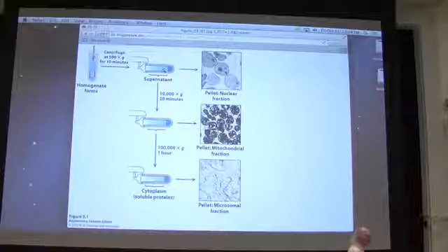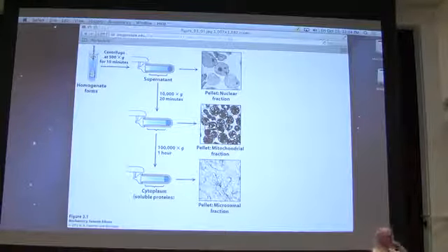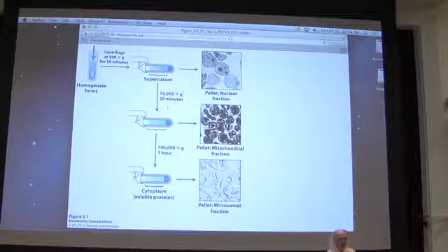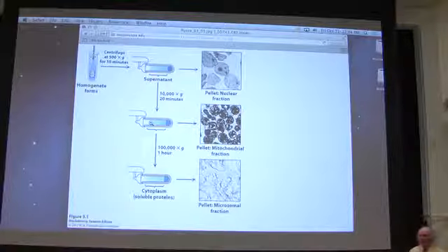If we spin that at a low rate, we will precipitate certain big things. We spin it at a higher rate, we'll precipitate smaller things. Okay? So usually we'll spin it at a slow rate at first to get rid of the cellular debris, the nuclei, and things like that. Okay? And then we'll pour off that supernatant and take that supernatant, which is the liquid part, and spin it at a higher rate.